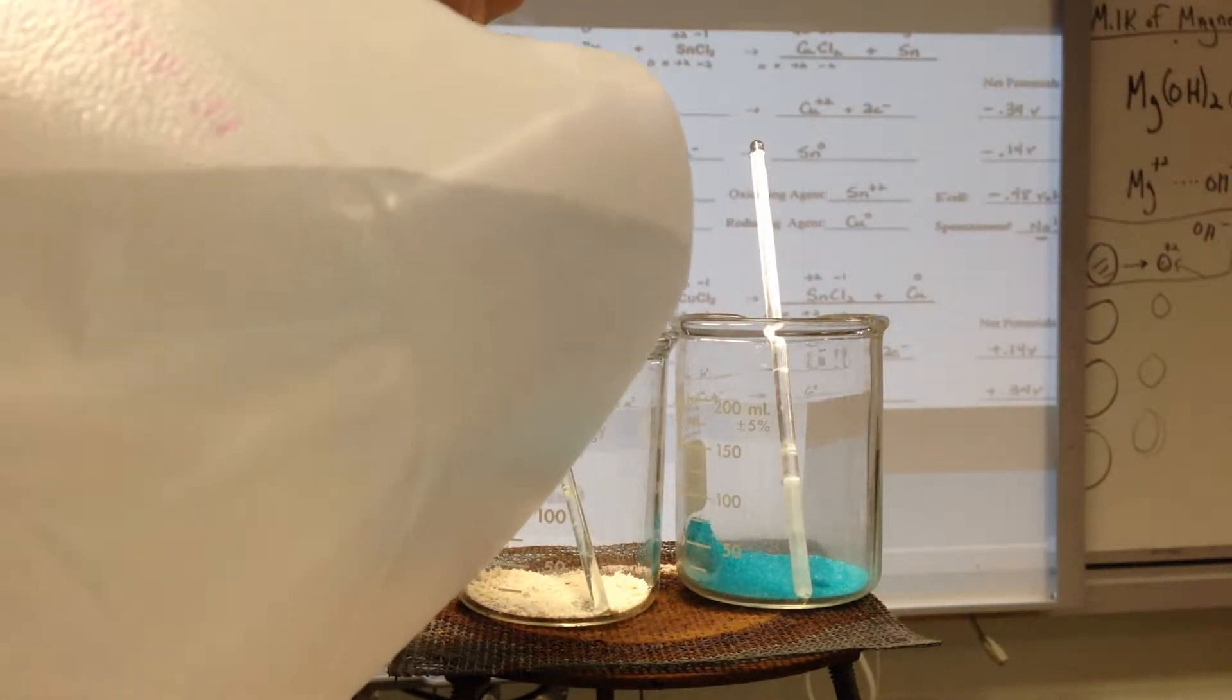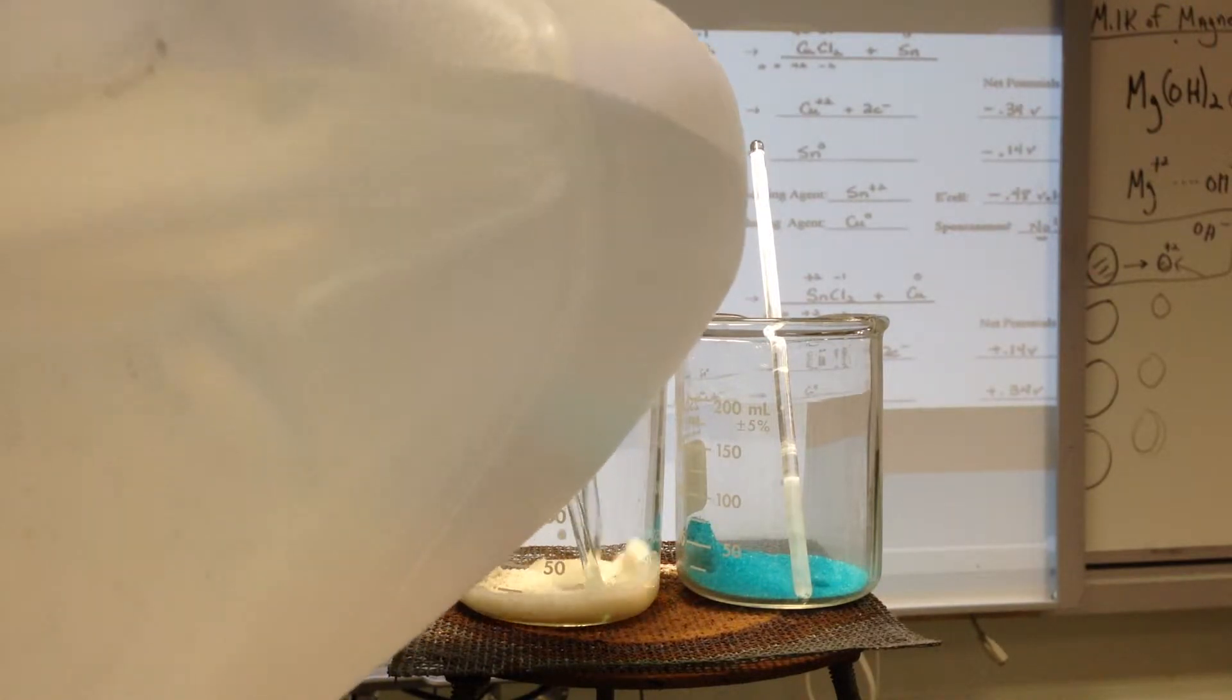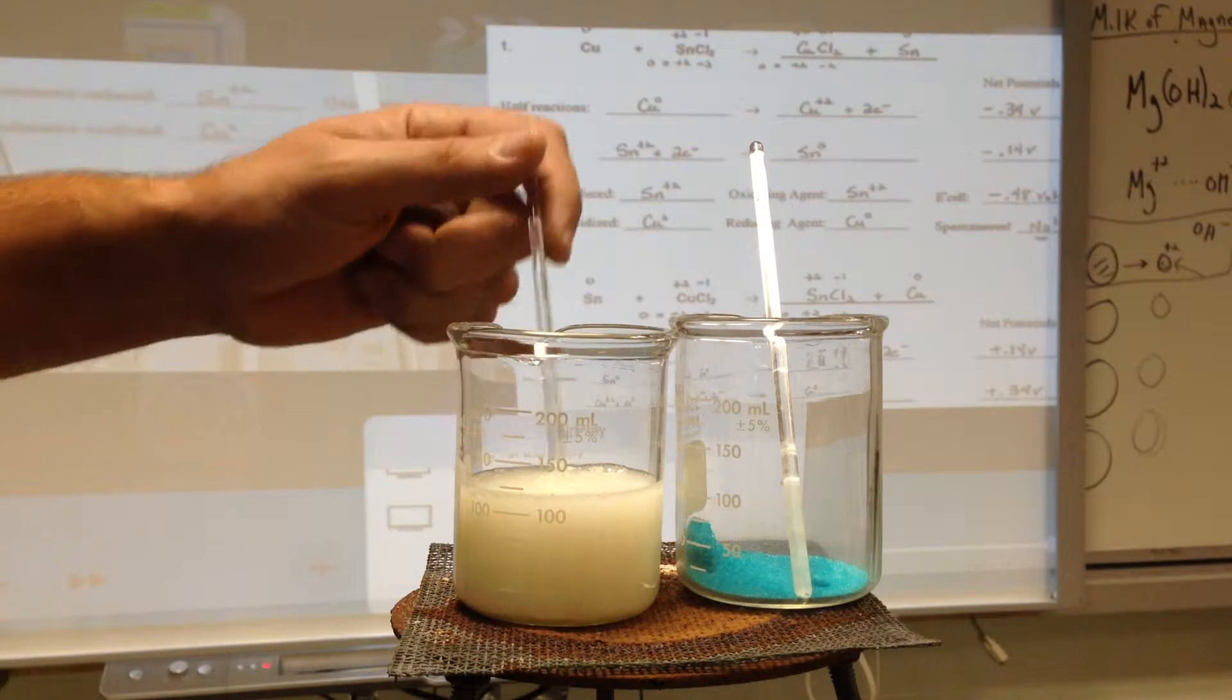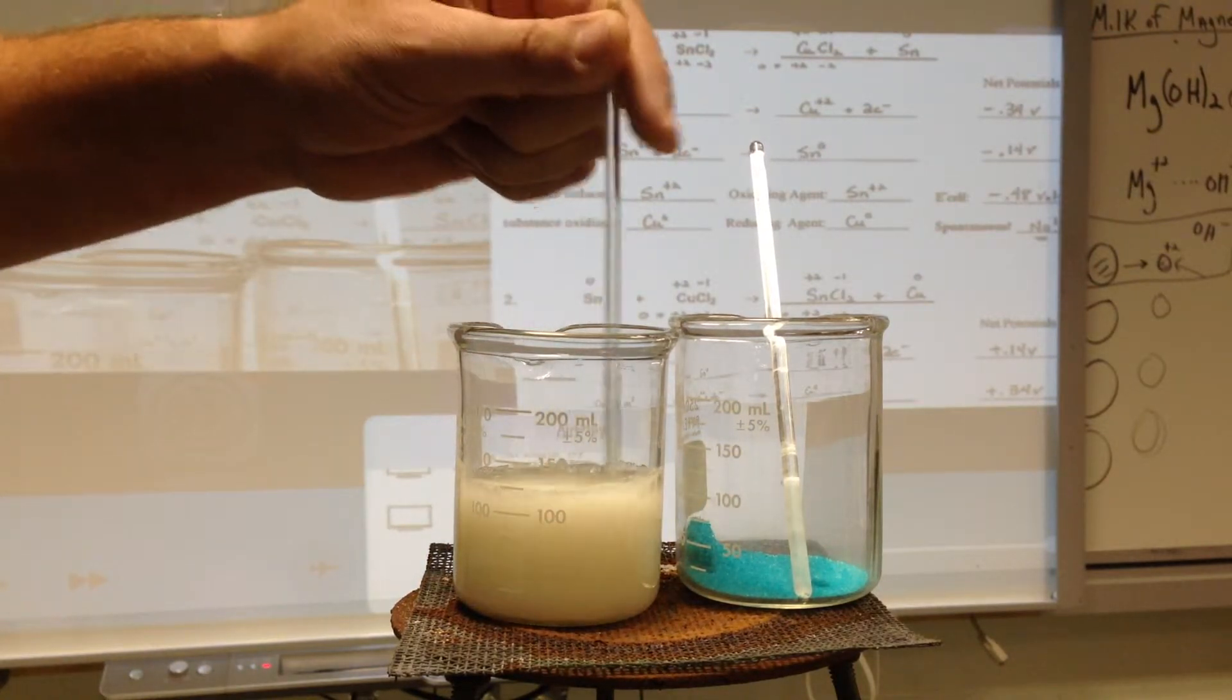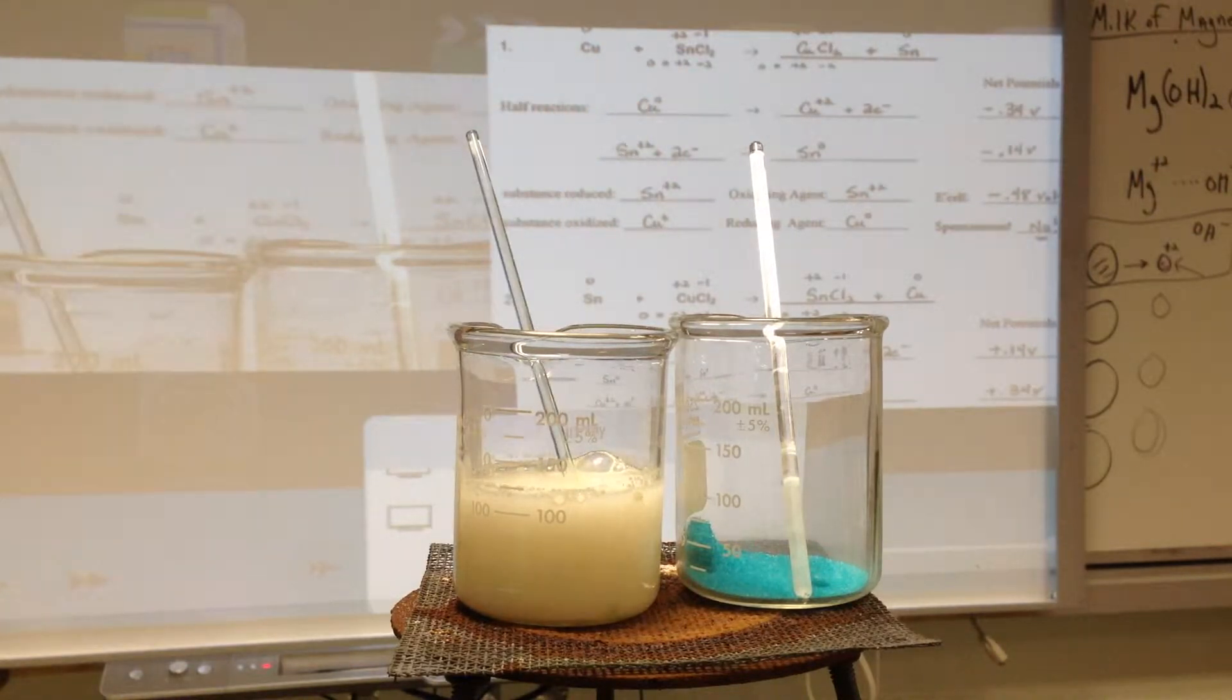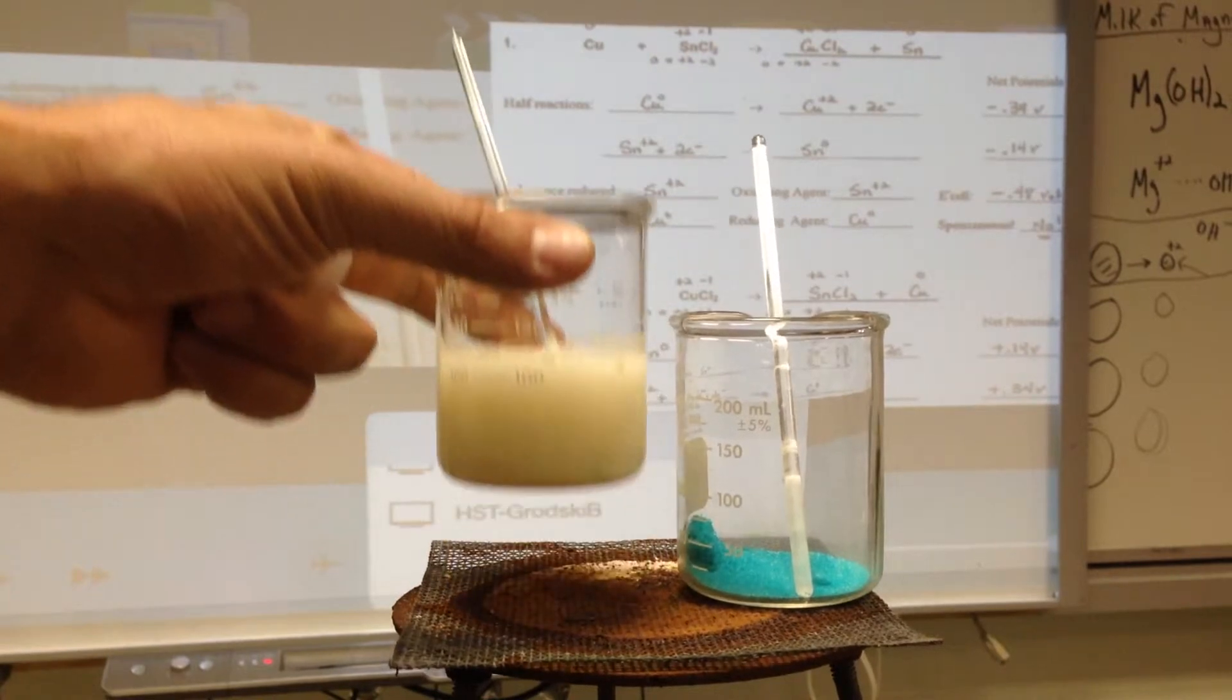I have tin chloride, which isn't very soluble, so it's going to make a milky solution. It's a colloid. It's not really going to dissolve, but there's some dissolving going on. I've got tin plus two in the beaker to the left, and I know you don't see much of it because it's kind of cut out.